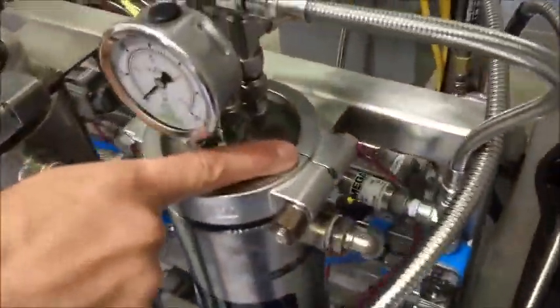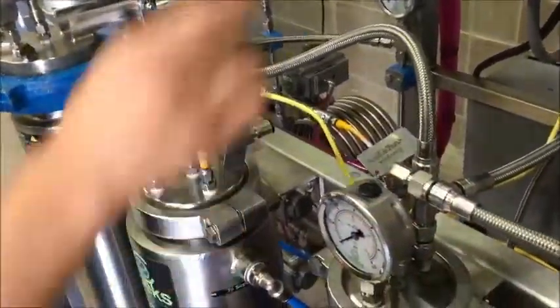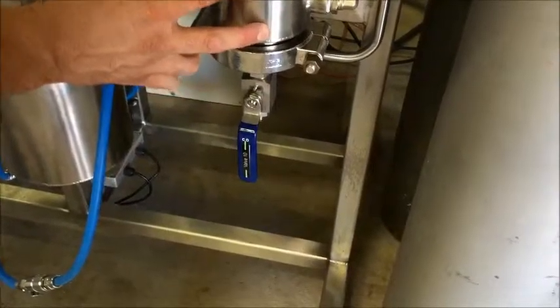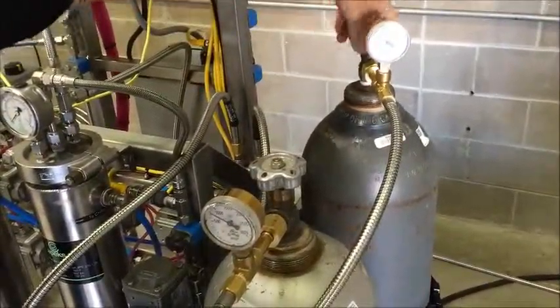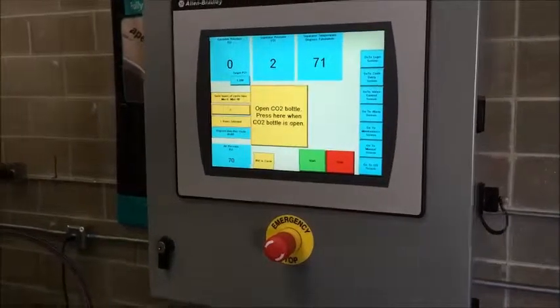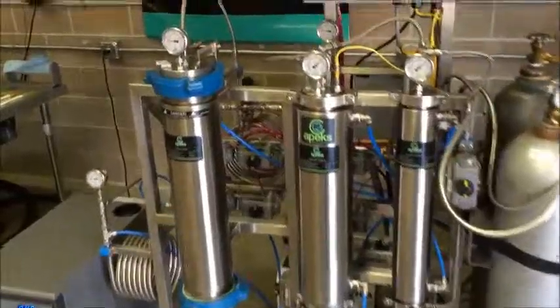Now it's reminding us to check everything. It tells us to verify our separator vessels are secure — we're just checking each one of these clamps, making sure they're all tight. There should be about 1/8 to 1/16 inch spacing between these two tri-clamps. We also check the fittings up here to make sure they're secure. It reminds us to make sure our extractor is secure, which we already tightened. Then it tells us to close valve 10 — the only manual valve on this system — which will be opened at the end of every run to vent remaining pressure, then closed before we start a run. Finally, it tells us to open our CO2 bottles. This is gas-fed, food-grade CO2 — we do not recommend using liquid down-tube CO2 bottles. When we acknowledge, the system takes off and does its thing.